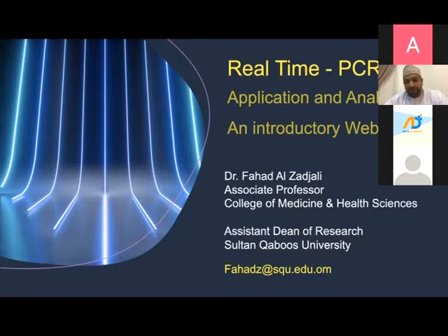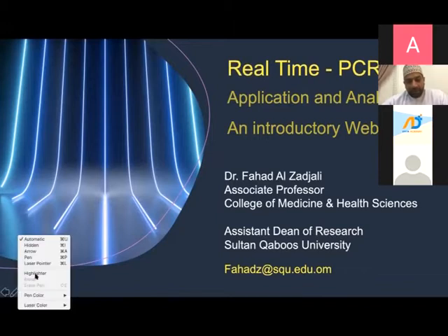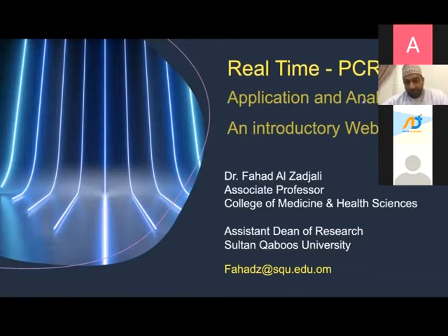And basically in this introductory webinar, I'm going to discuss 3 points. The first point is basically to understand what real-time PCR is, because if you understand what real-time PCR is, it makes it easier to understand how it is used and what you can use it for. So we're going to discuss different applications and later on also the different analysis modes, because this is also very important in real-time PCR. It's not only doing the experiment, it's actually how you analyze the data that you get from the real-time PCR.